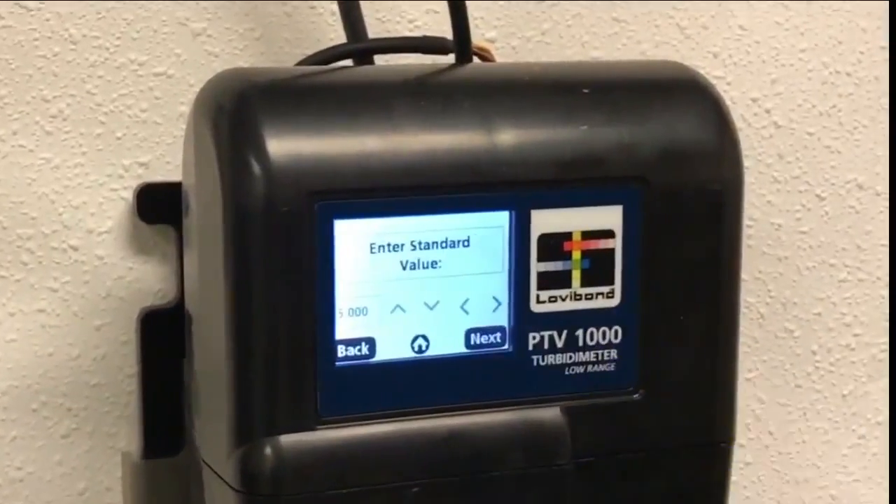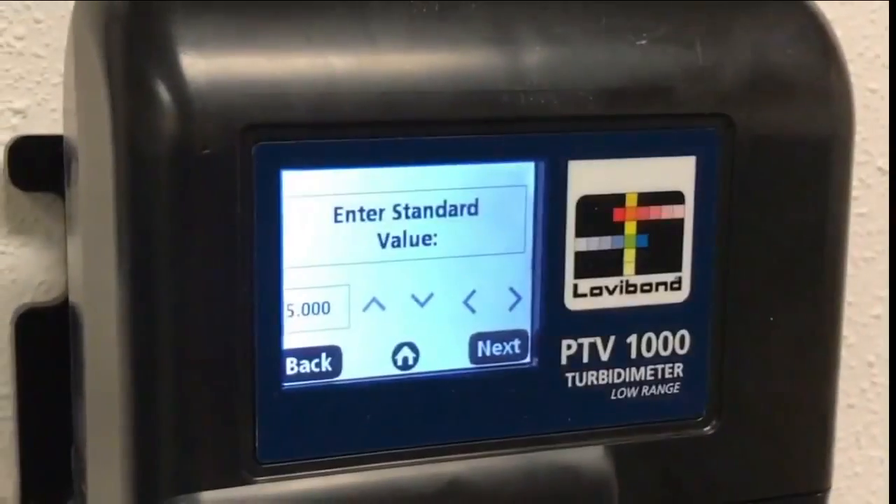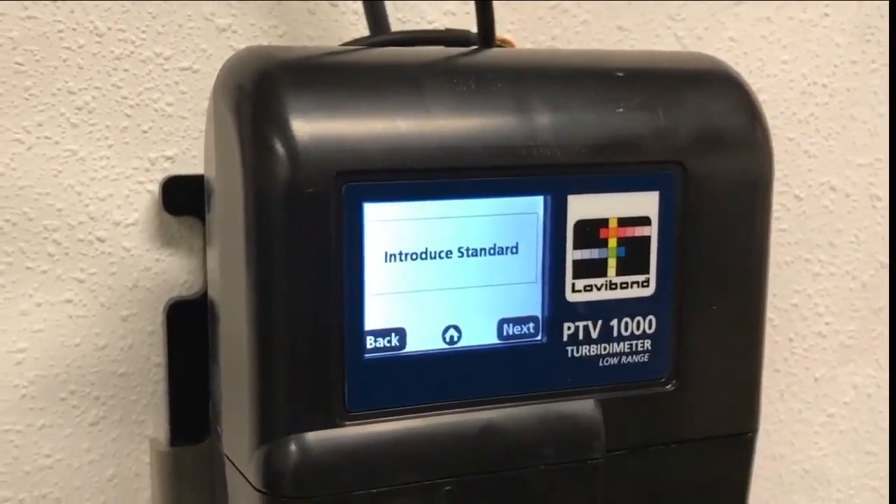Next, the PTV prompts the entry of the standard value. In this case, the value is 5 NTU. Once you select the value, the standard can be introduced.